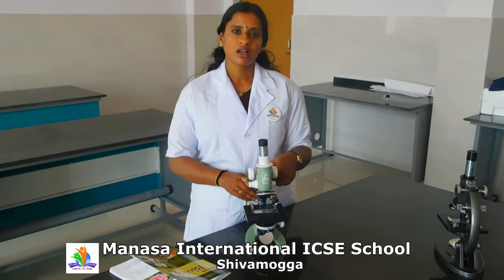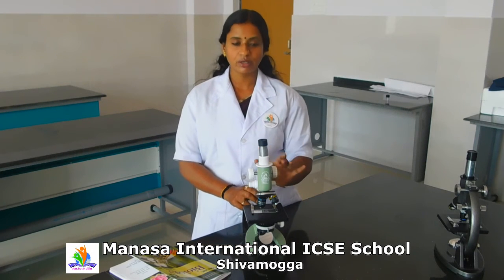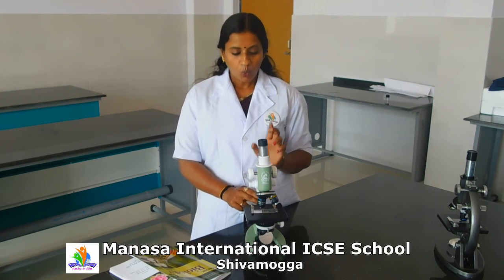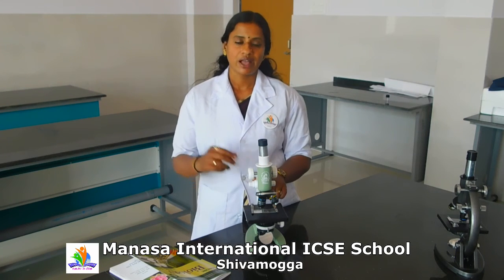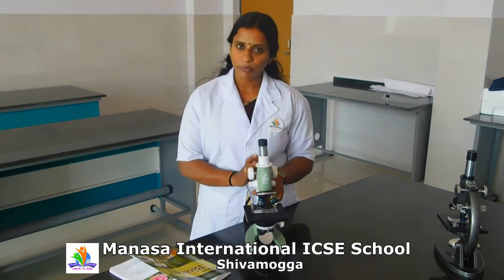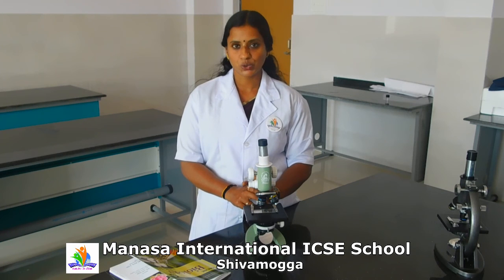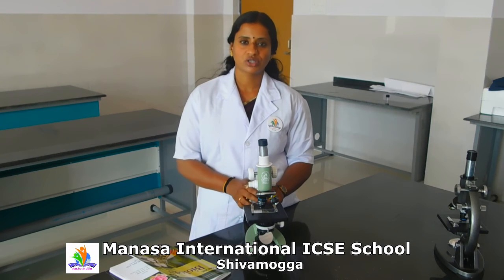So dear students, in today's biology practical class, I have explained you about the different parts of the compound microscope, which is used to observe the slides, the materials, right? Watch the video at least 3 times through your headphones and open your textbook and be very much perfect with the labelings of the compound microscope. So this is the starting class where you will come across this, and it will go up to your +2, that is 12th grade. So don't be very negligent about your studies.